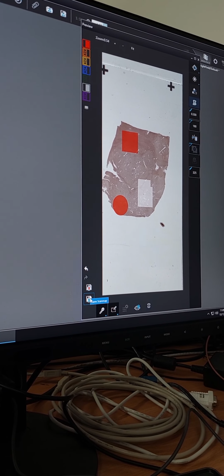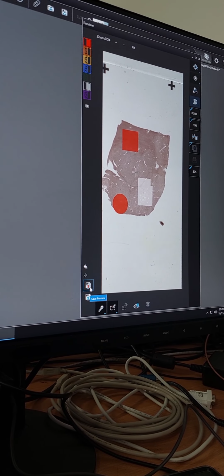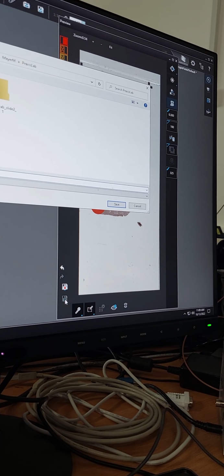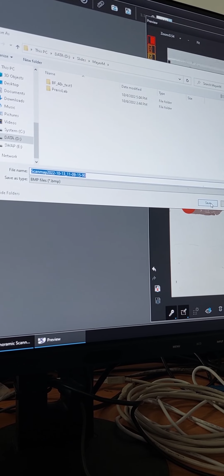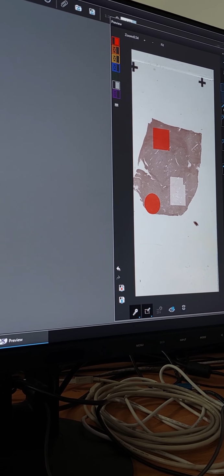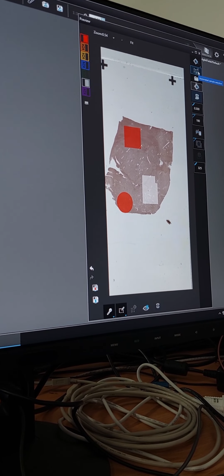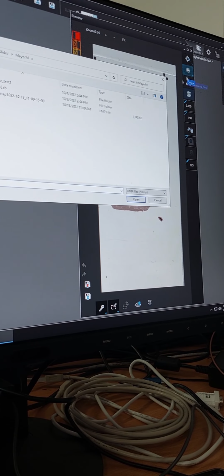If I have a certain scan map like this, I can save it. I can save the scan map, or I can save this whole preview in the form of a picture. It could be useful later. If I save the scan map here in this folder, you will have a third mode to choose the scanned area, beside thresholding and manual: a loaded scan map.